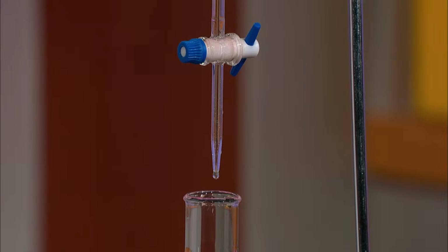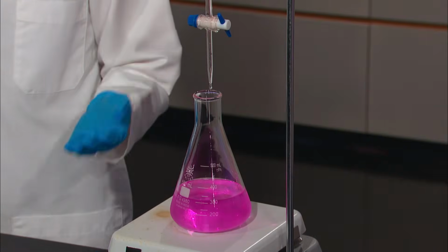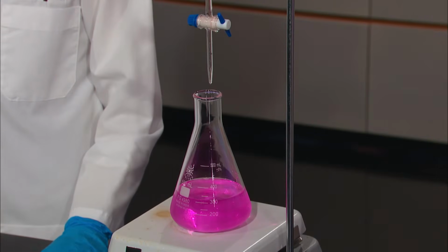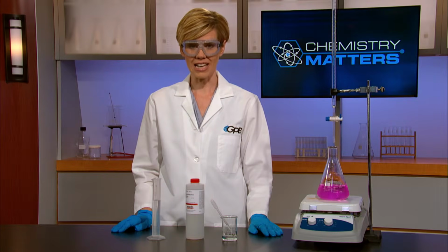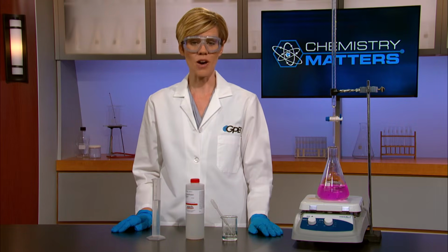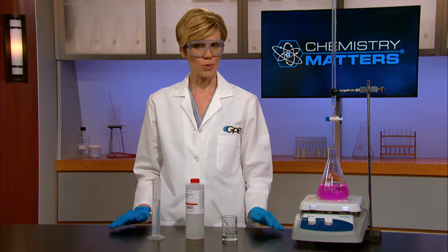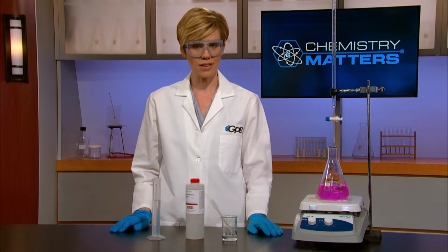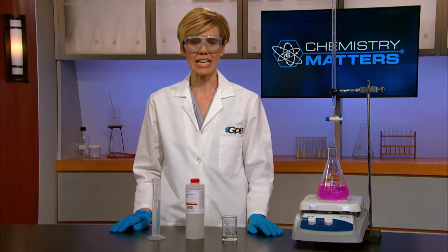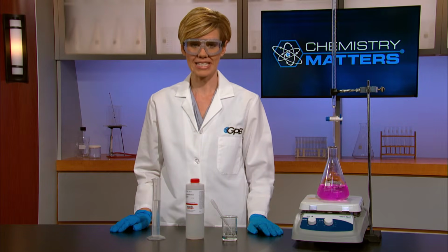And the correct indicator will change color the moment you reach the equivalence point in the reaction. Once I finish neutralizing the base, I can use the burette to see how much acid I used. I'll subtract the amount of acid left in the burette from the amount I started with. Armed with the volume and concentration of our acid solution and the volume of our base solution, we can calculate the concentration of the base.